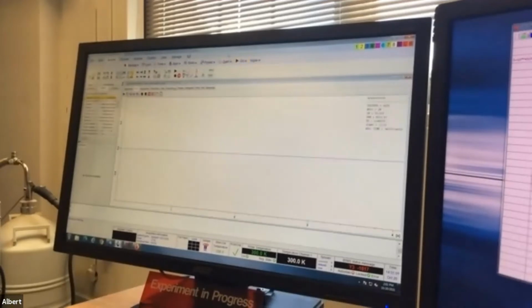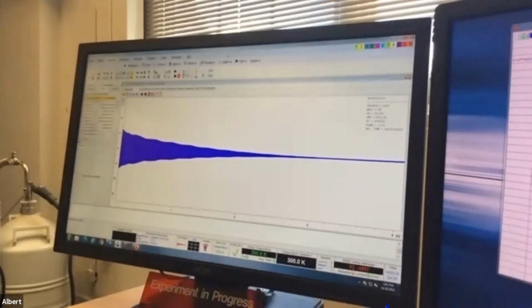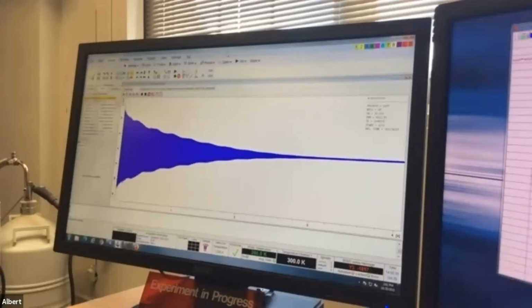So normally for a proton NMR, you want to do 16 scans, and what you're going to see on the screen is a graph start growing in. Every scan is a pulse of radio frequency radiation that's hitting your molecule and affecting the magnetic field around the hydrogen. That's why we call it proton NMR. Every time it pulses, you hit it with radiation, but in between the pulses, the protons relax, and then you hit it again. So you keep doing that for 16 scans.